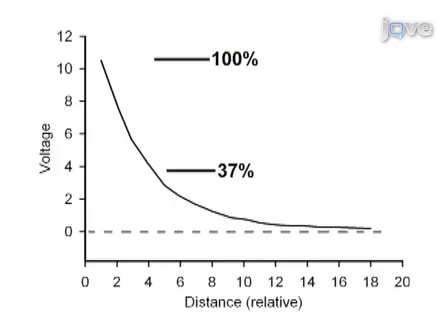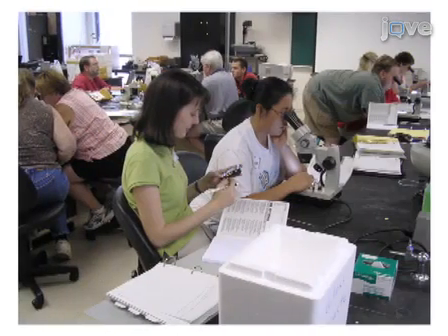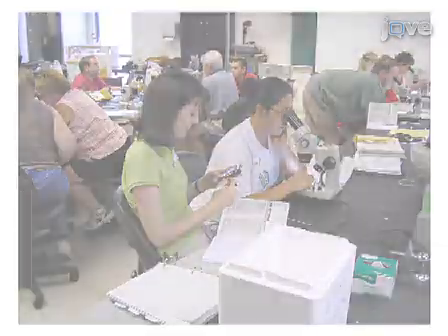can be useful teaching tools, as demonstrated by altering the components of a model circuit and by varying the stimulation of the live nerve. This method can provide insight into how biological membranes can be understood in terms of electrical models. It can also be applied to other tissues such as muscle. Visual demonstration of this method is critical, as a dissection of the ventral nerve cord and recording setup can be difficult at first, and care must be taken to avoid damaging the nerves so as to obtain a good setup for stimulating and recording from the nerve cord.